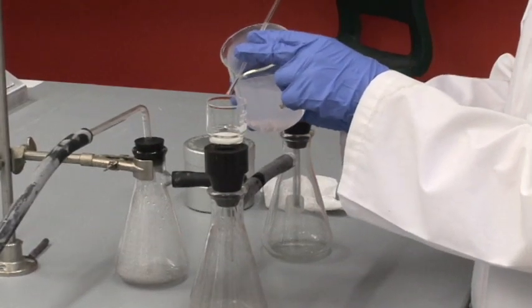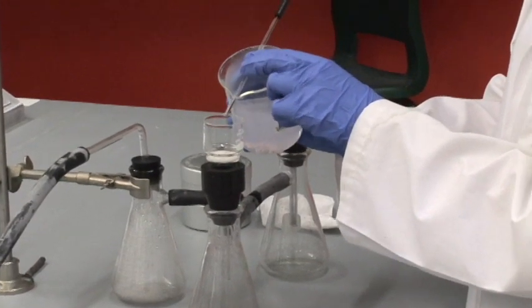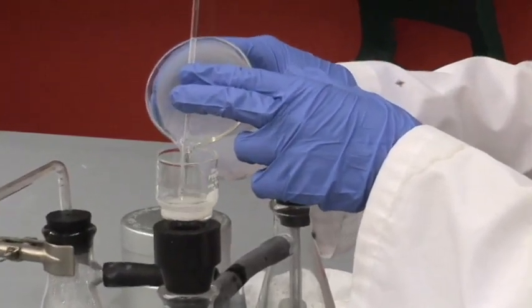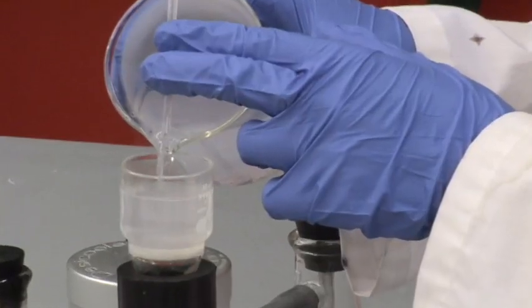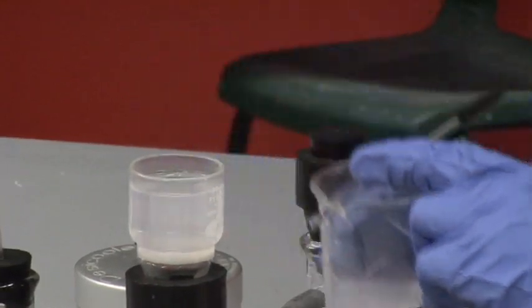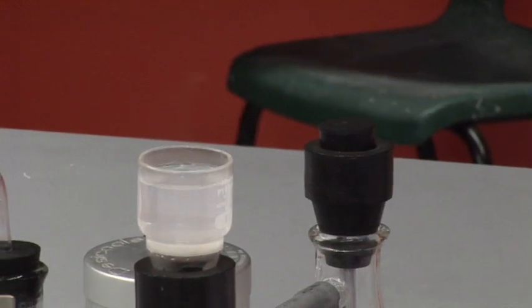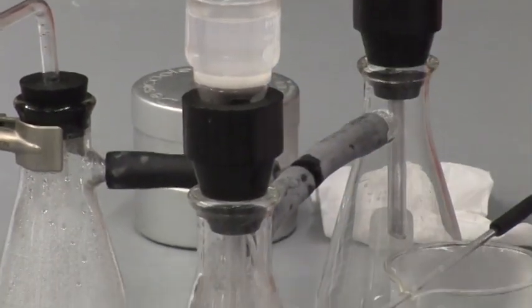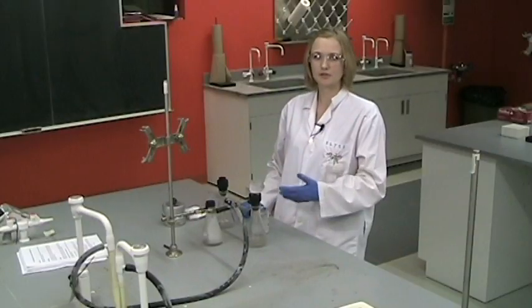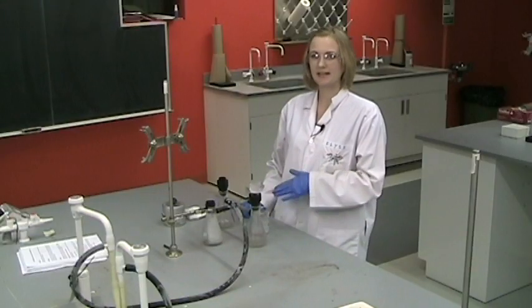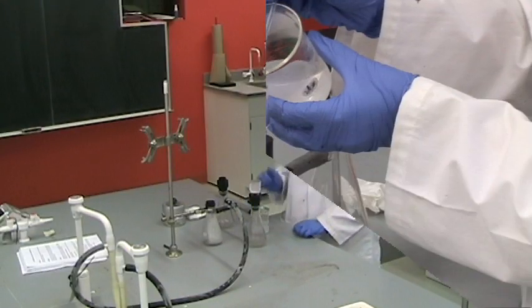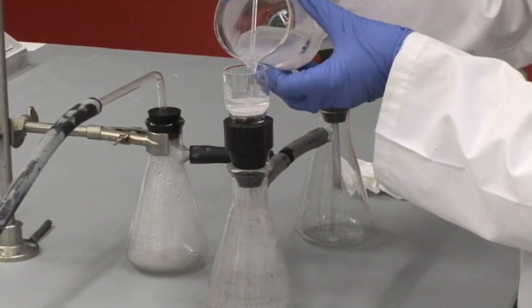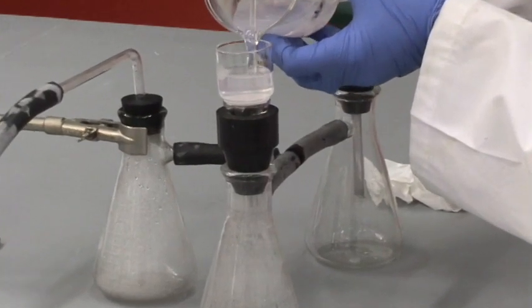In order to decant, you will hold your glass stir rod across the mouth of the beaker like this and pour down the stir rod into the crucible. The stir rod will help prevent the bulk of the precipitate from going onto the crucible and will then allow us to rinse the precipitate in the beaker when we're done. So you will continue to decant until all of the supernatant liquid has been filtered.